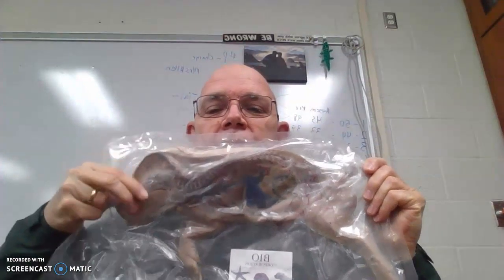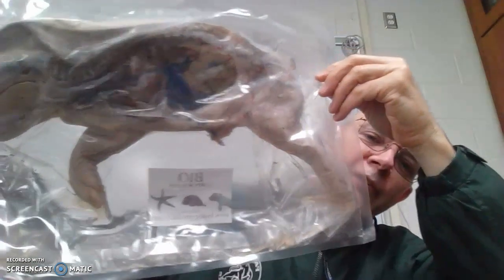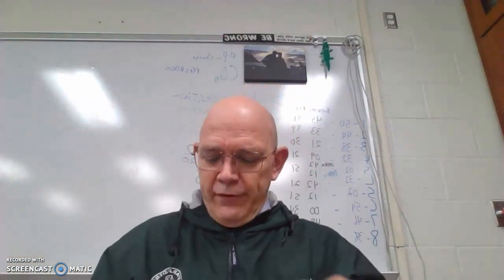All right, here's the head, and here you can see the tongue and the mouth, and then it works its way back here. And they've basically taken a pig and sliced it down the middle. Don't ask me exactly how they do that or what kind of knife or system they have for that, but they have actually sliced it in half, and you can actually see a profile of the whole pig.